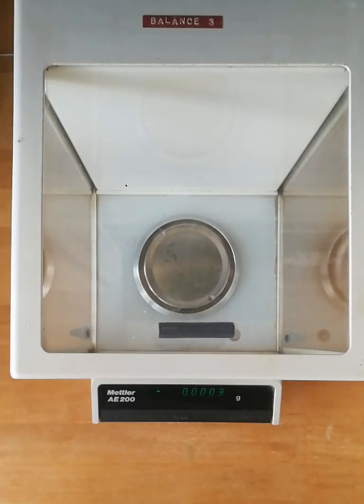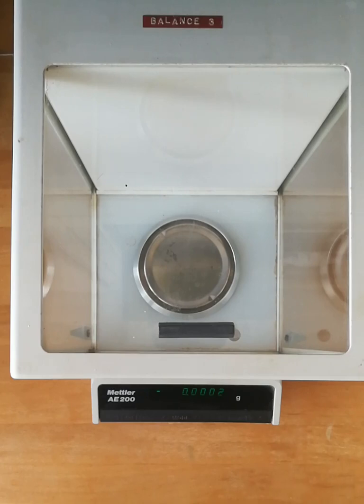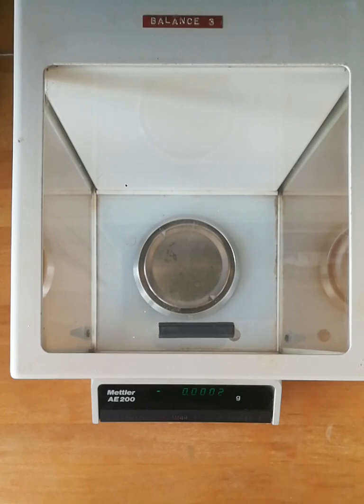Looking at the Mettler AE200 precision balance going down to four decimal places, I'm going to show you some of the features and how to run the built-in calibration feature, which is really useful.